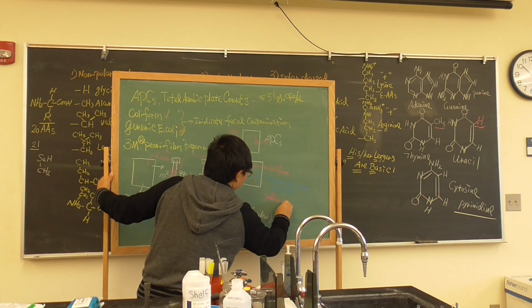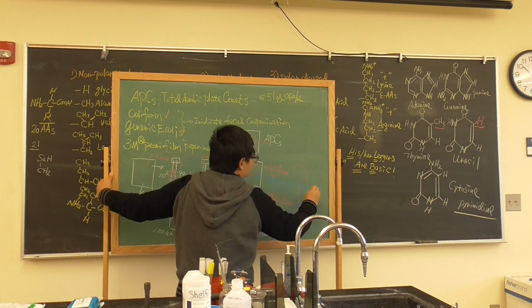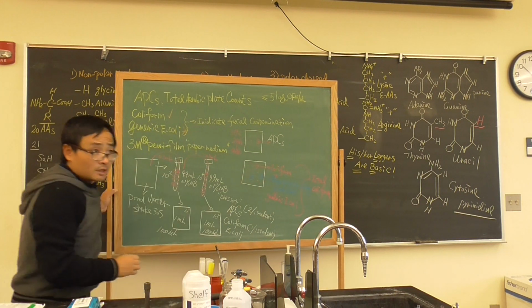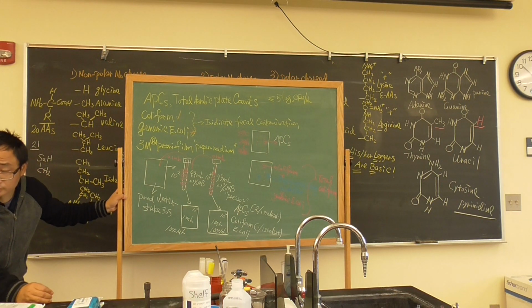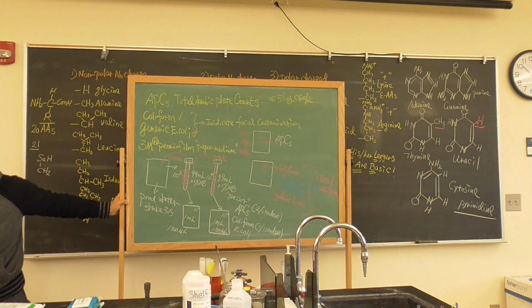Generic E. coli. Now what is a total coliform? You have to add them together. This is called total coliform. Okay? But sometimes you need to know, if it's really dominated by fecal contamination, you may find all of them are E. coli or generic E. coli.